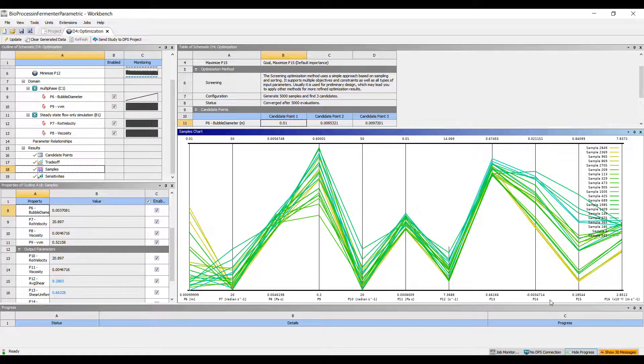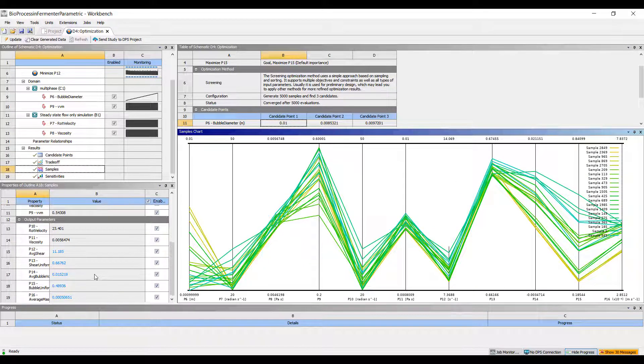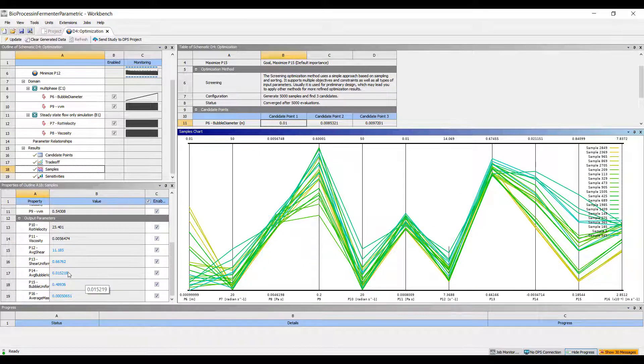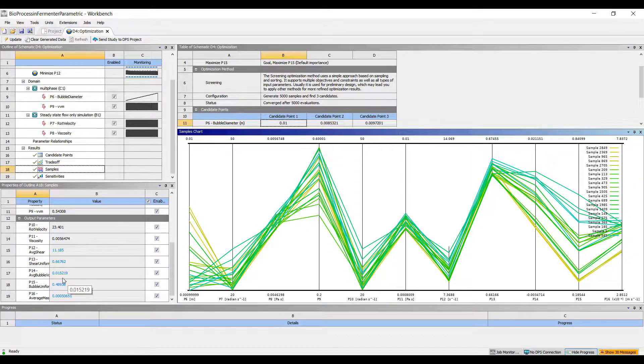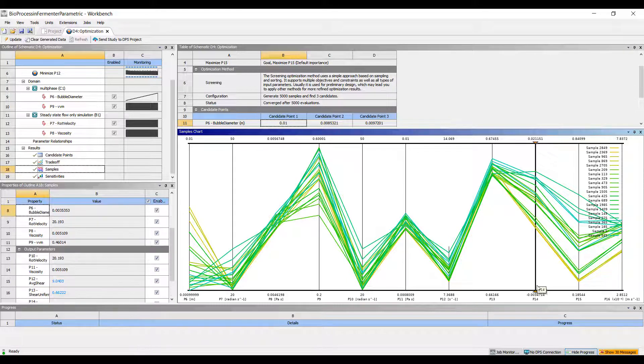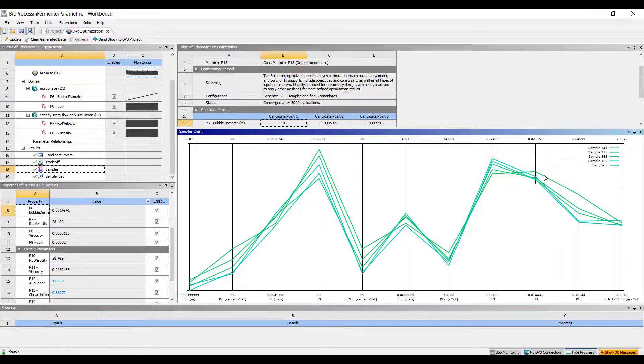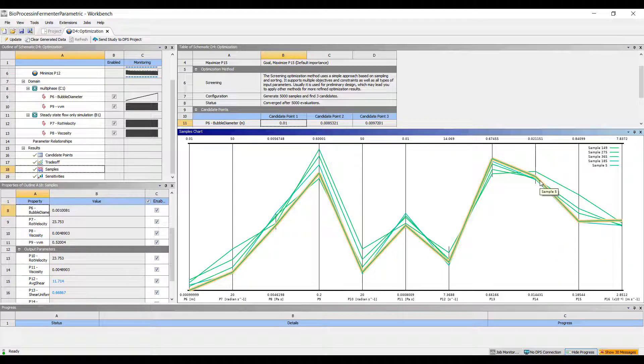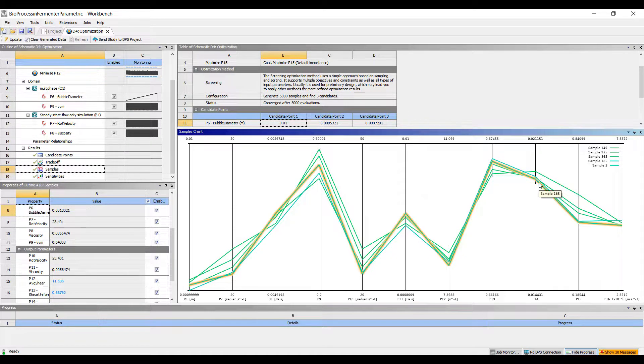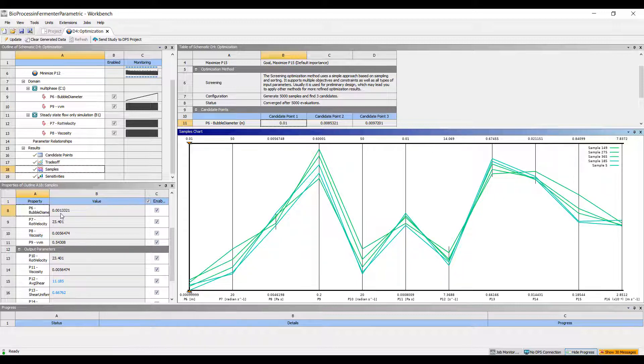From then, we want to ensure we have plenty, maximized amount of bubbles, that's P14. So we can get rid of that, and look, we have a few potential designs that informs us on what the rotational velocity should be, and what the bubble diameter, and also how fast that should feed the system.